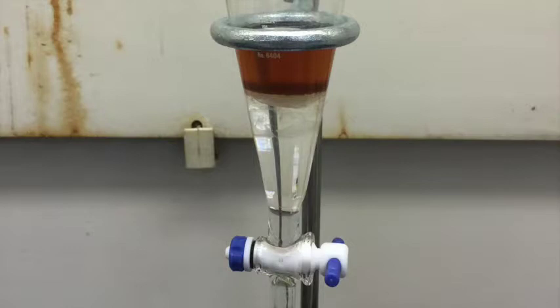Chloroform is a great solvent for extracting drugs. We have to be careful with it because it is carcinogenic, but we use it a lot, and you can see that's what we're using here, and it's sitting on the bottom.